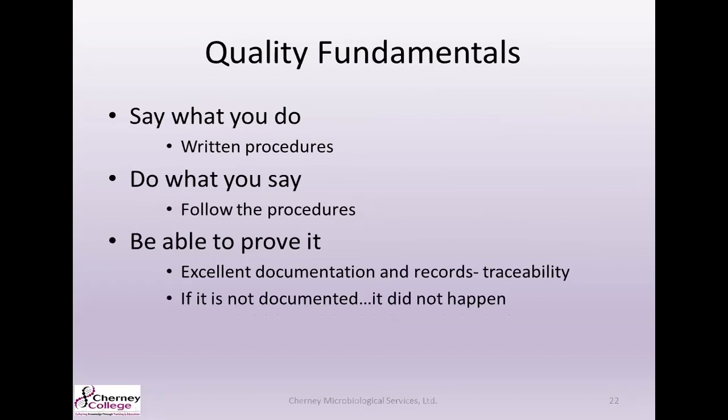Some fundamentals of quality, you're going to want to say what you do at your facility. That's going to be your written procedures, your methods of analysis, your SOPs. And then you're going to want to do what you say, which is following through and doing those procedures. And then most importantly, when it comes to audit time, you're going to want to be able to prove it. Make sure that you have excellent documentation and records for traceability. And we say here quite a lot at Cherney, if it's not documented, it did not happen. You're not going to be able to prove it to an auditor unless you have accurate documentation.